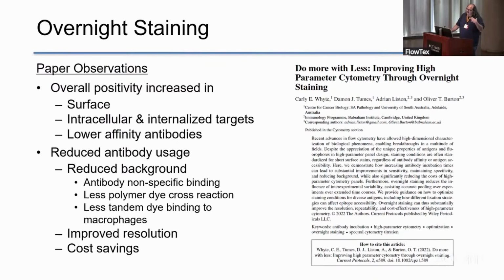And one of the ones I also thought was most important was actually the improvement with the low affinity antibodies, such as CD25. Okay, now that's wonderful to get a better signal, but they achieved that through a reduced usage of the actual antibodies.